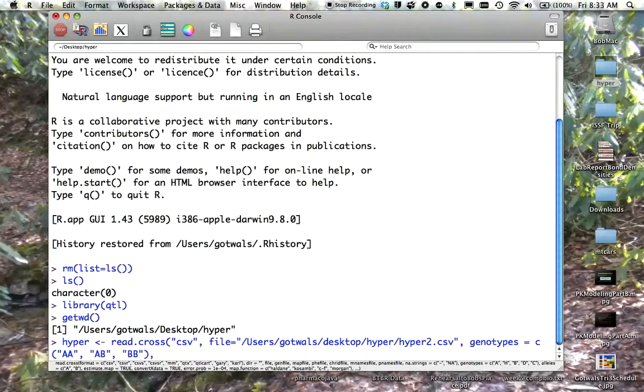Now you remember that there was a lot of missing data in there, so I have to say na.strings, meaning these are characters, equal to double quote, hyphen, double quote, because if you remember in the data set, all of the missing data was represented with a hyphen. So na.strings equals "-". By the way, you notice in R, when I'm doing two-word things, a lot of these are separated for readability with a period in there. So you need to make sure you know that.